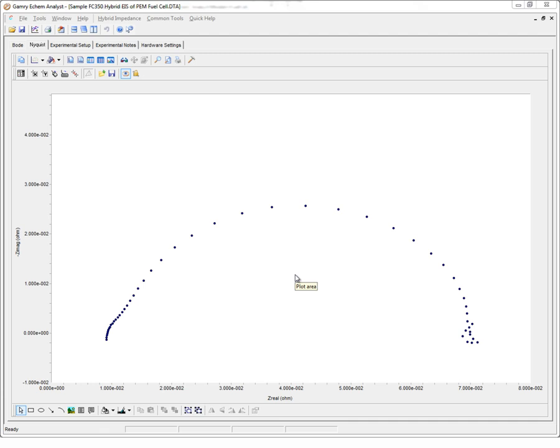The Autofit routine is a new feature included in version 6 of our software, and is available for all three types of impedance studies: Potentiostatic, Galvanostatic, and Hybrid.